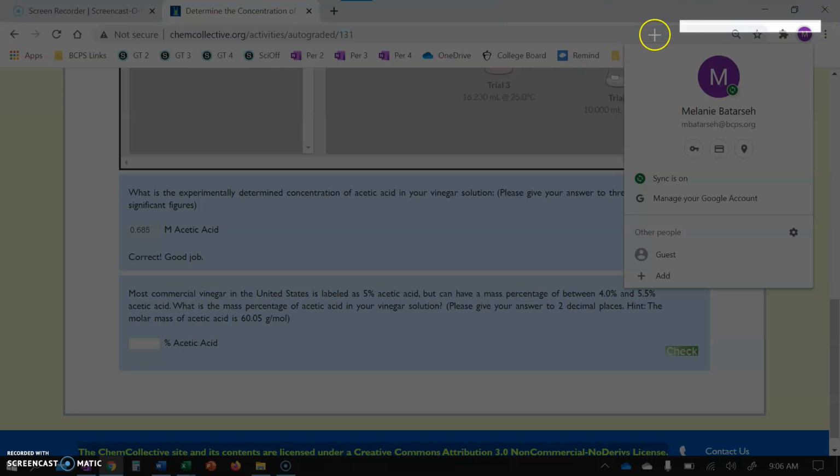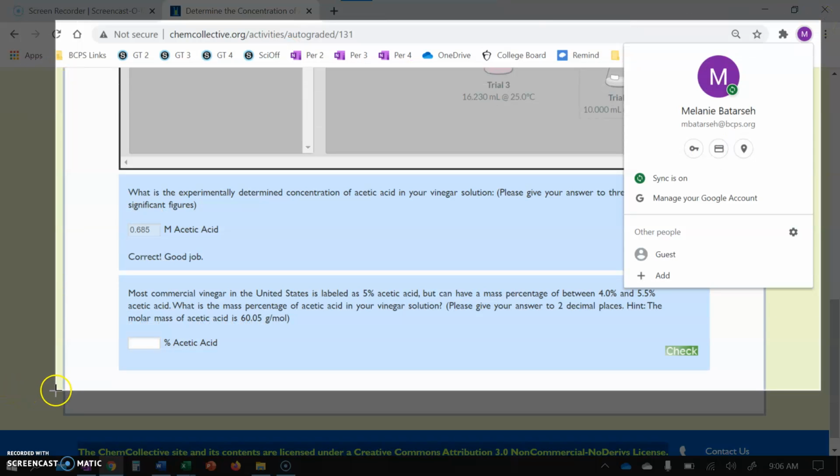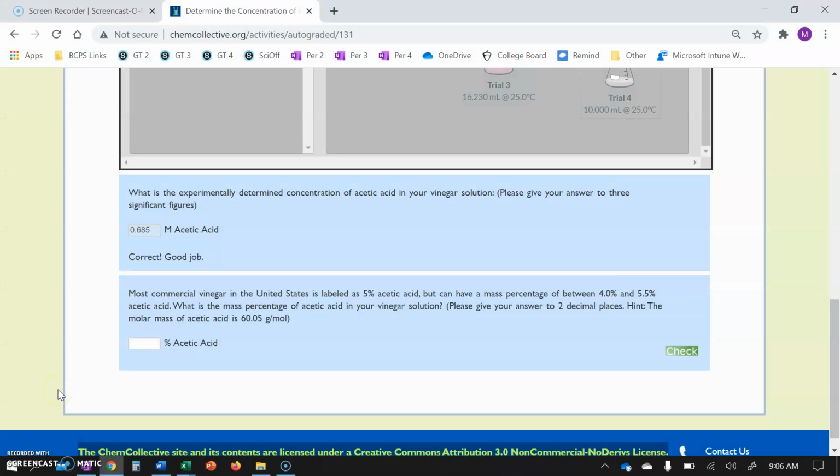But I want you to make sure you get all of your name in here and get the yay, good job, you did it right in here. Okay, take that screenshot and then you can send me that screenshot. I haven't actually decided how we're doing that yet. I think you'll probably paste it into a file and then send me a file. But I'll need that picture to know that you did the work and that you got the answer right.